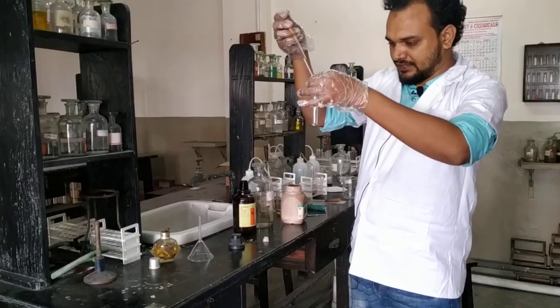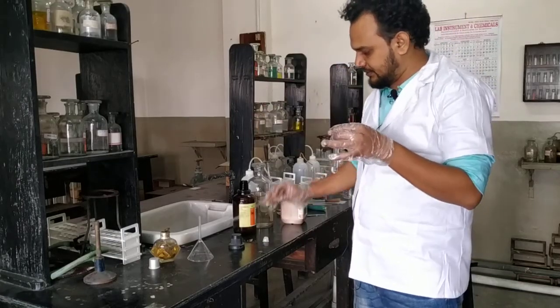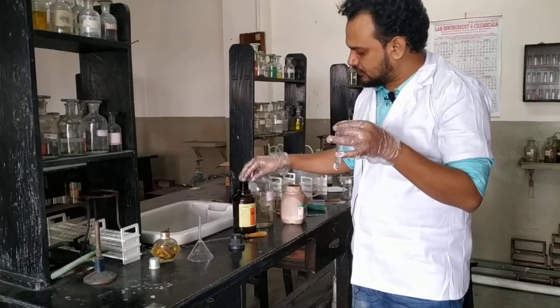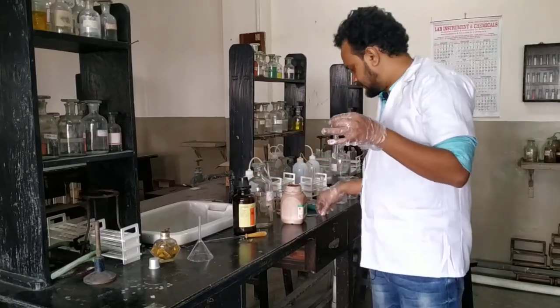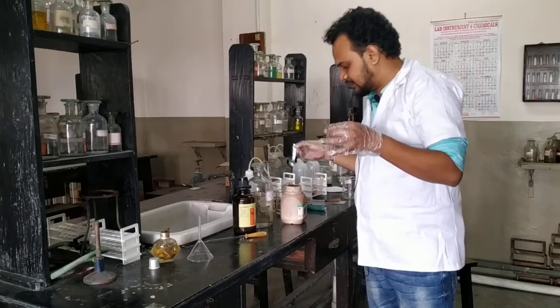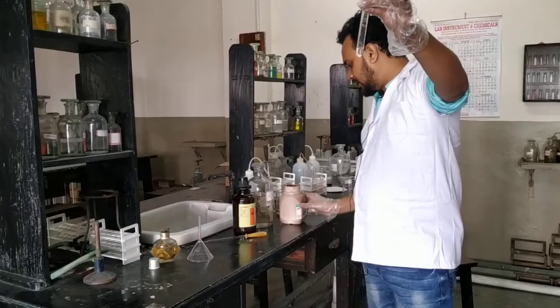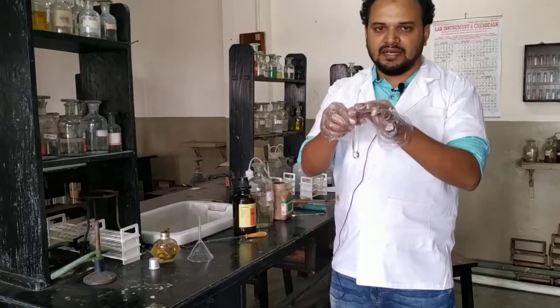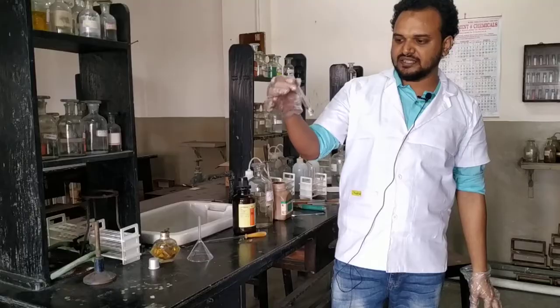So here is my formaldehyde — about one ml. Then I add only one crystal of resorcinol. See — only one crystal. Don't take more than that.